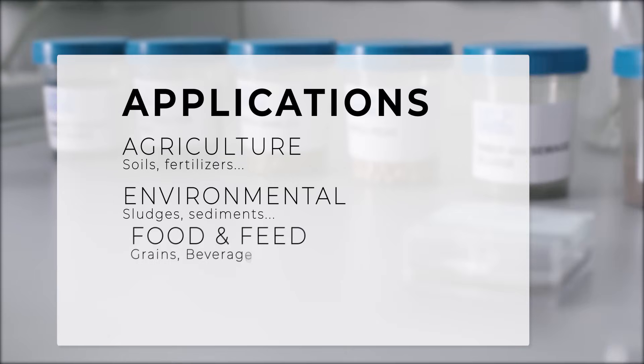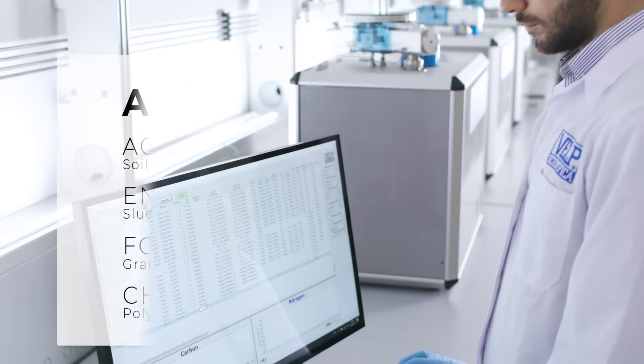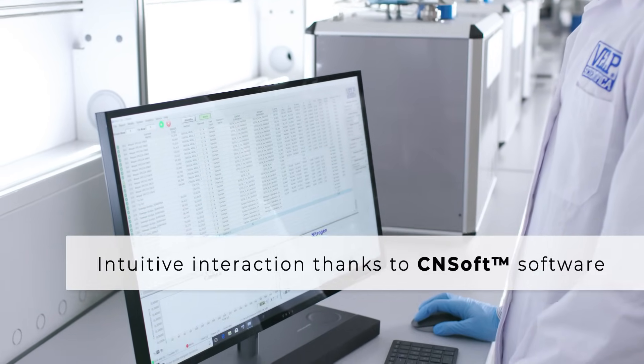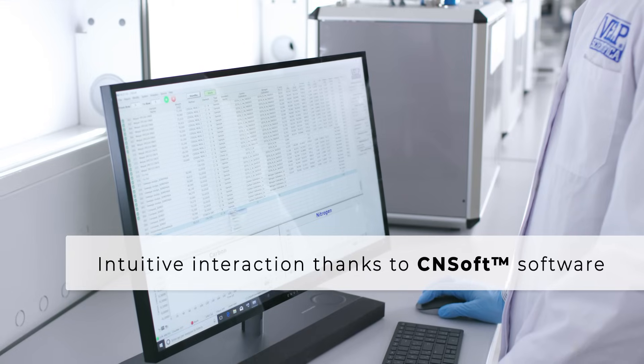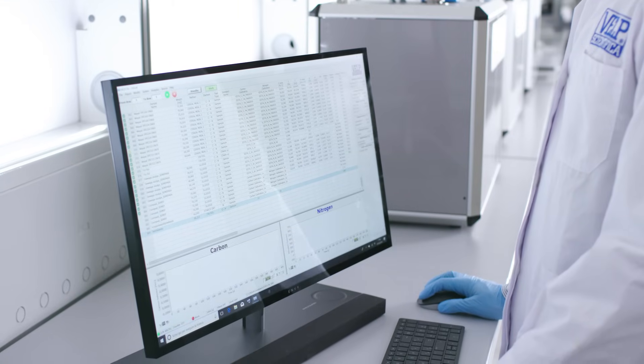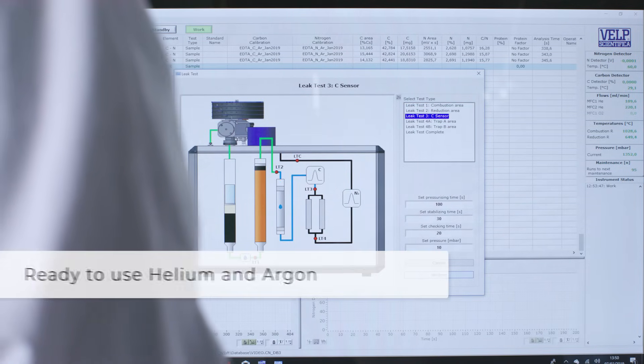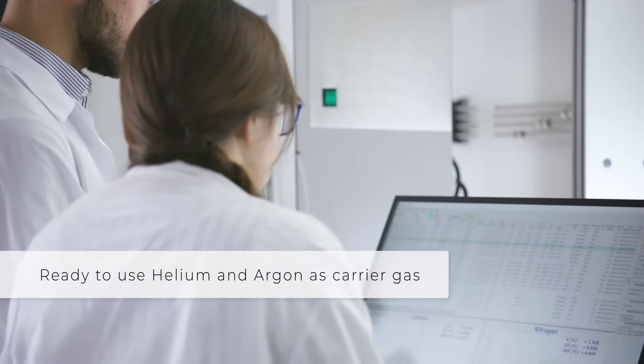Environmental, food and feed, and chemical sectors. The VELP CN802 is a versatile and cost-effective analyzer controlled by the powerful CNSoft software and is able to work with carrier gases such as helium and argon without the need of any hardware modifications.